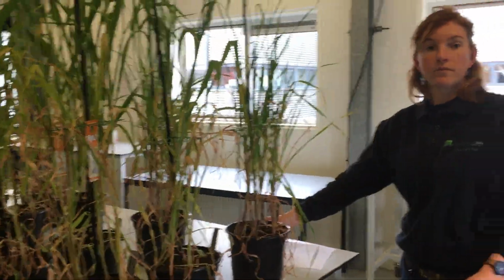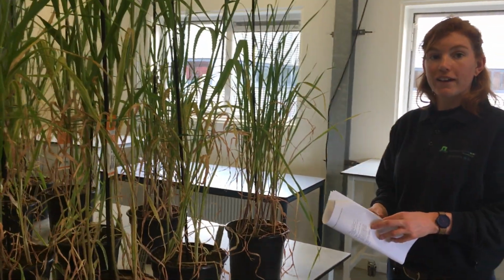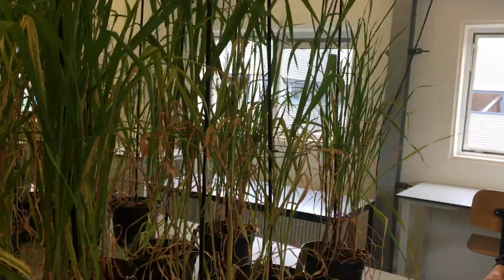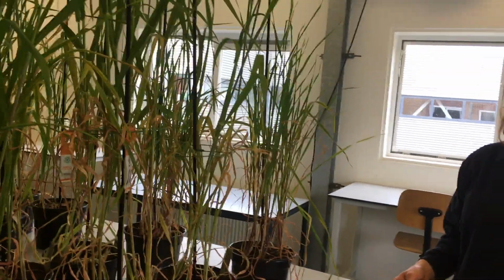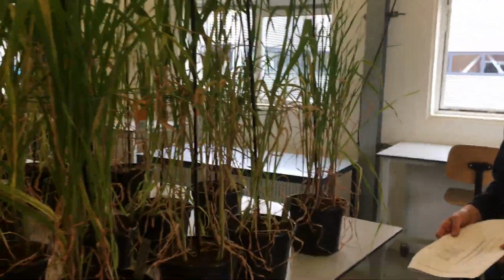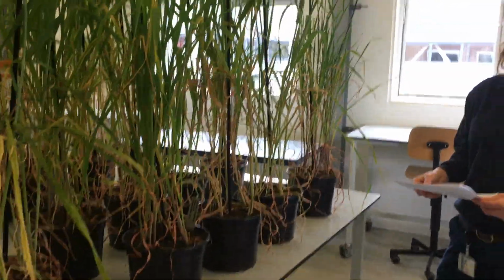We write it down as the average of the score for each cultivar. Pauline will score all these 5. Then I will score them also. Then we take the average for each cultivar of the 2 scores of us. So that's the infection score. Then you need to write it down as one replicate's data.